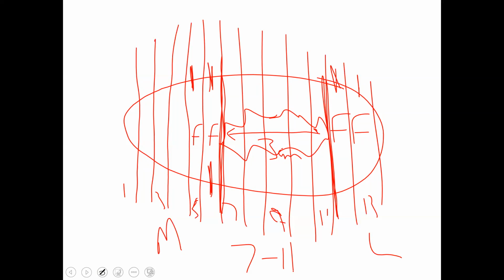The only way we can confirm that is to put these pieces under a microscope and say, yes, cancer in this slice and cancer not present in that slice. Somehow when we sign out, you have to be able to justify in your report how we're going to come up with a final size. As you're thinking about how you're going to submit your sections and gross the specimen, that's the only thing I care about. I don't care about anything else. I just need to be able to confirm the tumor size.